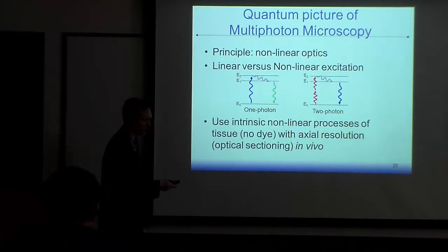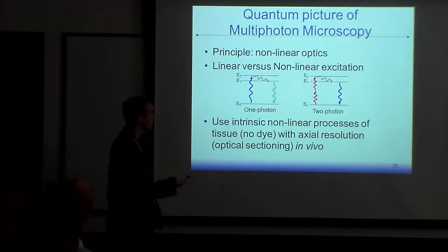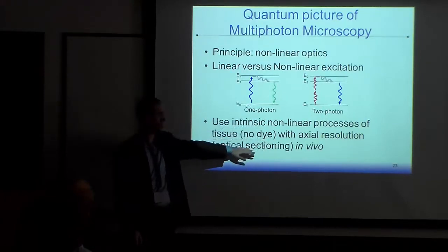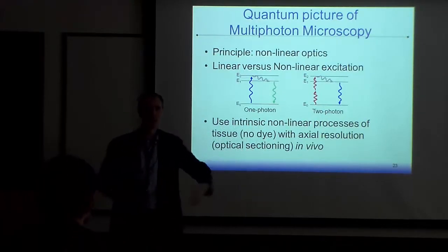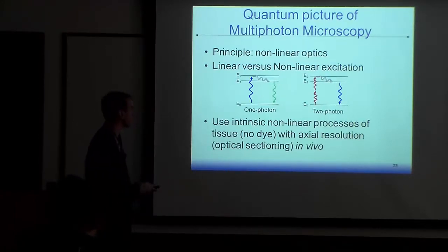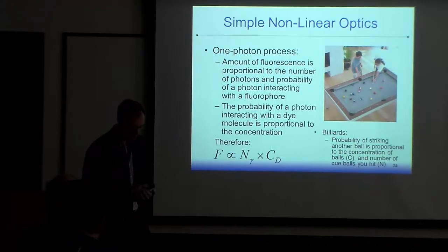With two photon, essentially you said, we have to have two intensity squared. You have this intensity coming in, so you need two photons that will simultaneously be absorbed. Same relaxation, the photon comes out. It's important to note here that the photon that comes out is actually at a shorter wavelength, higher energy than the photons that went in. And these processes occur both with dyes, and also a lot of tissue just does that on its own. So this type of signal is kind of common on its own. And I'll talk a little bit about that later.